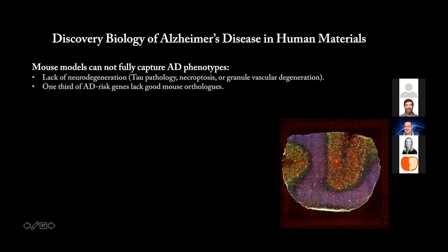As you can see here, we focus on the human brain section. We put it on the 2D RNA sequencing array, and we do the immunohistochemistry before we do the RT. So we will get the RNA and protein detection exactly on the same section. Here you see there are already some small spots, which are the blood vessels. And now we have already put effort into the image analysis and annotation to further point out the potential transcriptomic profile correlated to the vessels. And we look forward to further analysis.